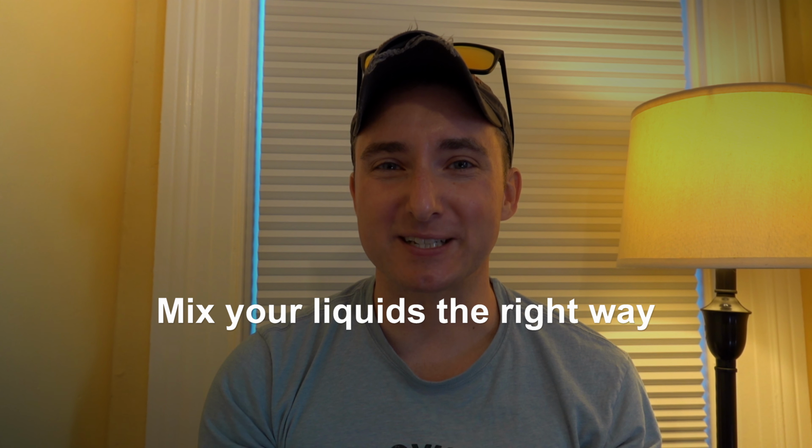Okay, so the second step that we're always asked to do is mix liquids together. So step number 2, mixing liquids correctly. And there's 2 common ways that we're asked to do this. The first technique involves using a vortex. And people use vortexes all the time in genetics labs. They're very familiar. But this is another area where technique tends to break down.